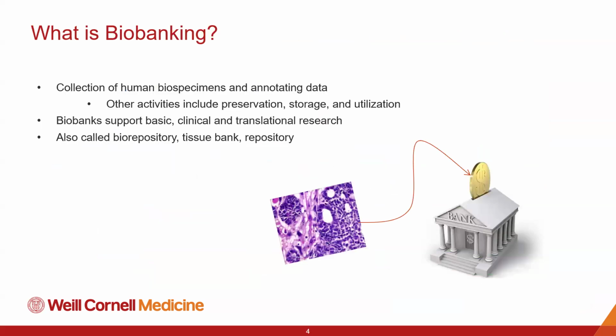First, I want to lay some groundwork of what biobanking is. Some of you might not be familiar with biobanking as a term, so I wanted to lay some groundwork before we dive into the discussion. So what is biobanking? Biobanking is a process of collecting, storing, analyzing, and using biological samples and their related health data.